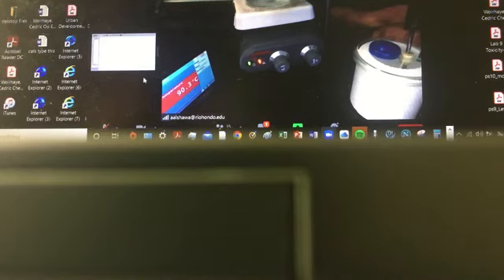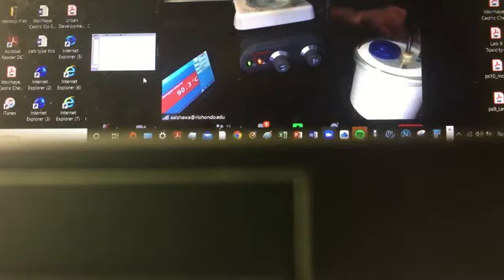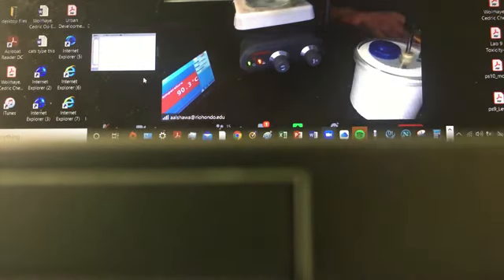It looks like it's not moving. Agree? So right now it is at 90.3, but it's not moving. So I guess if we sort of stuck at around 90.3, it's going to take a while to jump to 90.4.